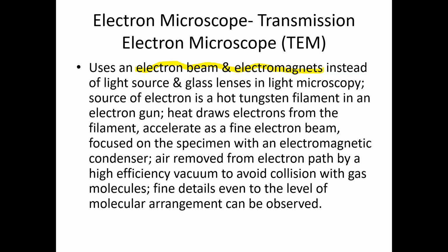Fine. So electron microscopes, whether TEM or SEM, both use an electron beam and electromagnets instead of a light source and glass lenses in light microscopy.